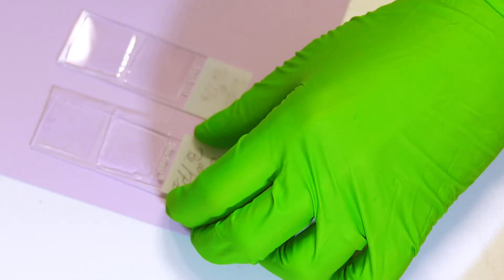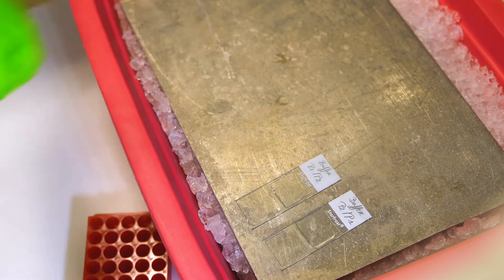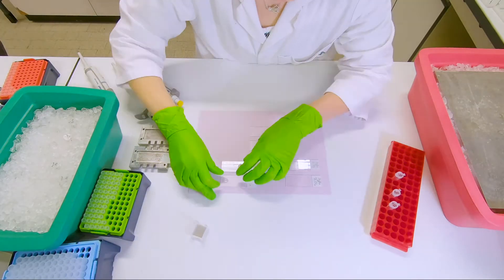Whenever one slide is ready, just transfer it to the cold metal plate to settle the gel. Then continue preparing the rest of the slides.